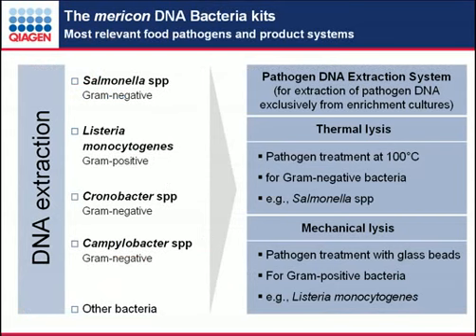Okay, so let's move to DNA extraction for food pathogens from cultures. There are obviously a number of different bacterial pathogens that are of great interest in the market today. Salmonella certainly is responsible for many, many cases of foodborne illness. Listeria monocytogenes causes perhaps lesser amounts of foodborne illness, but it's a terrible disease, and the mortality from L. mono infections is quite high.